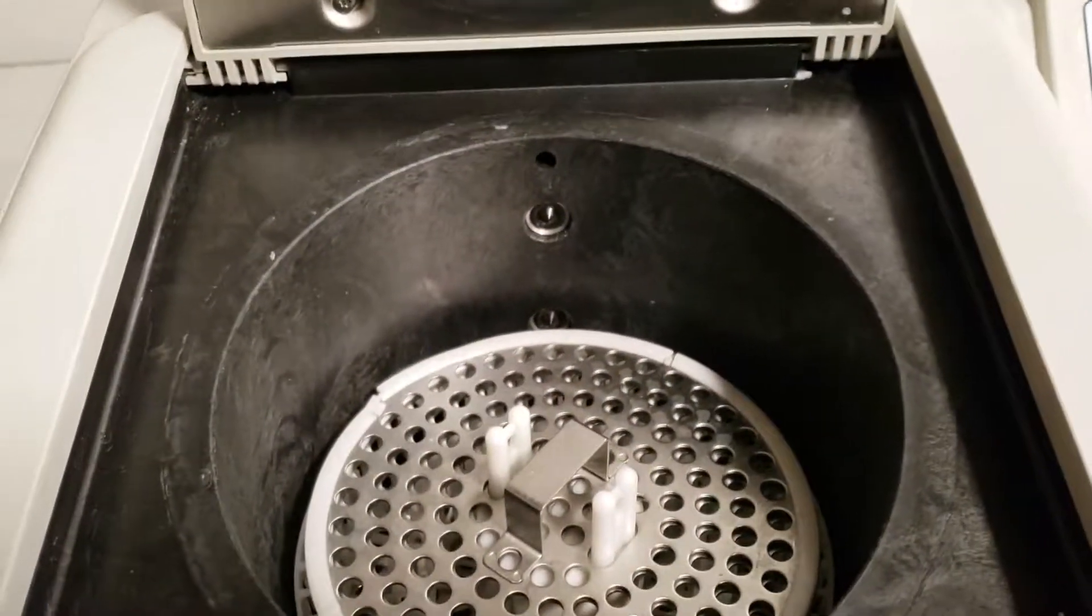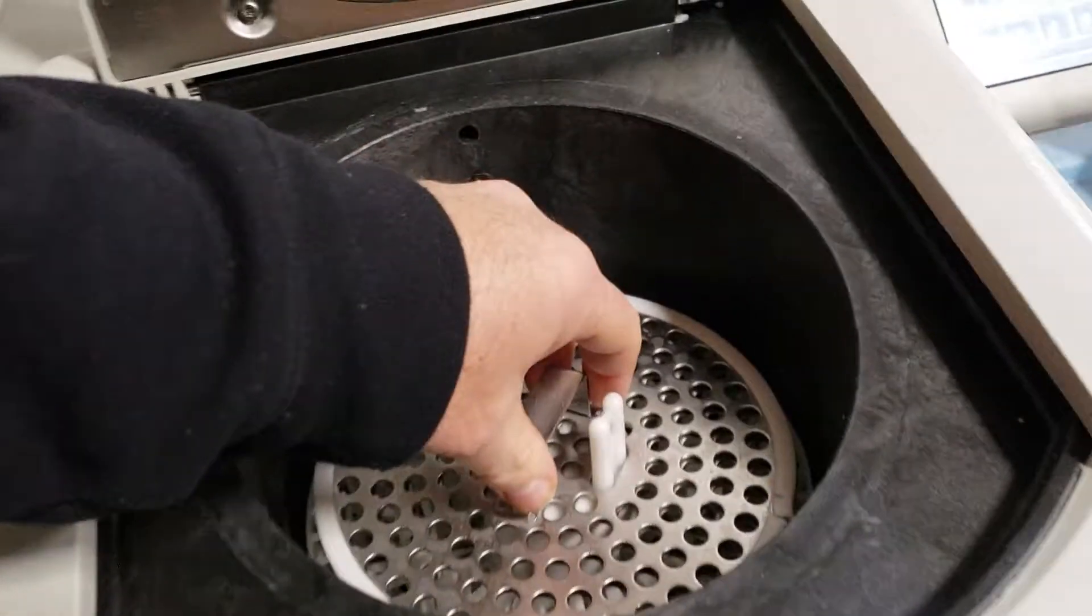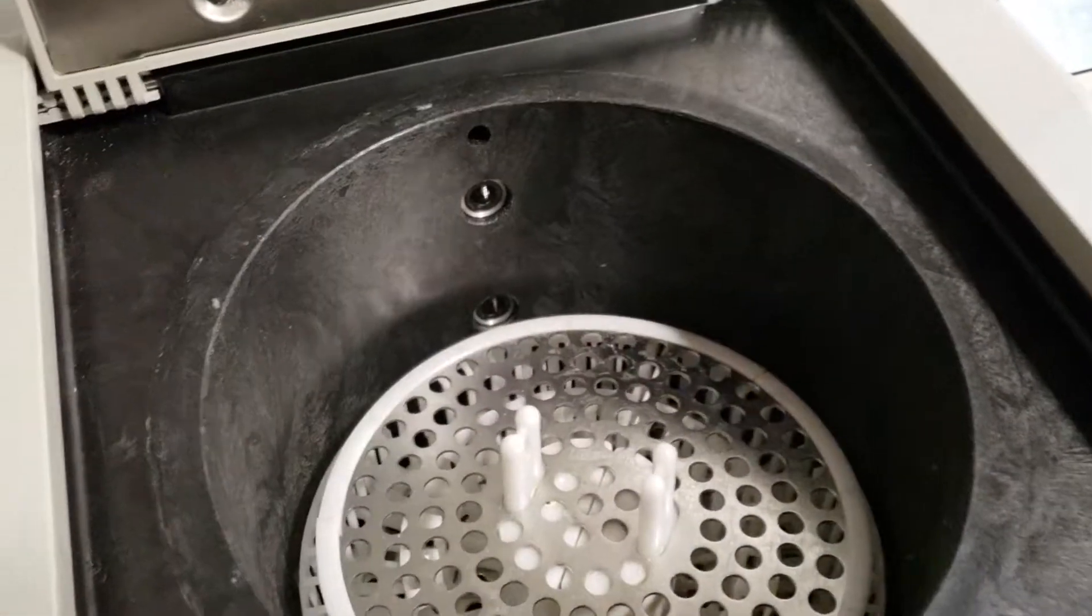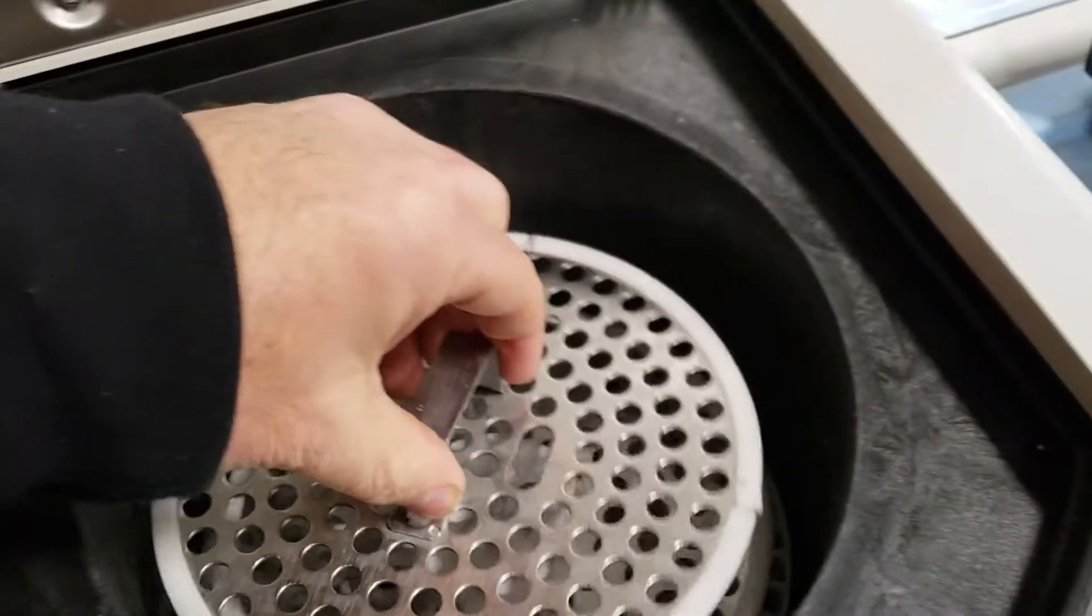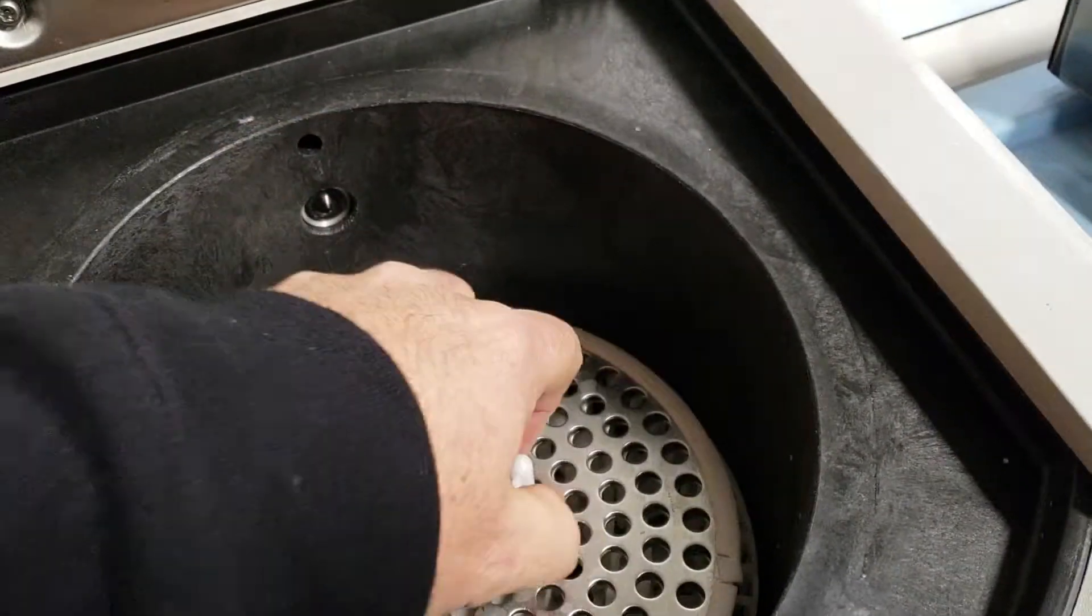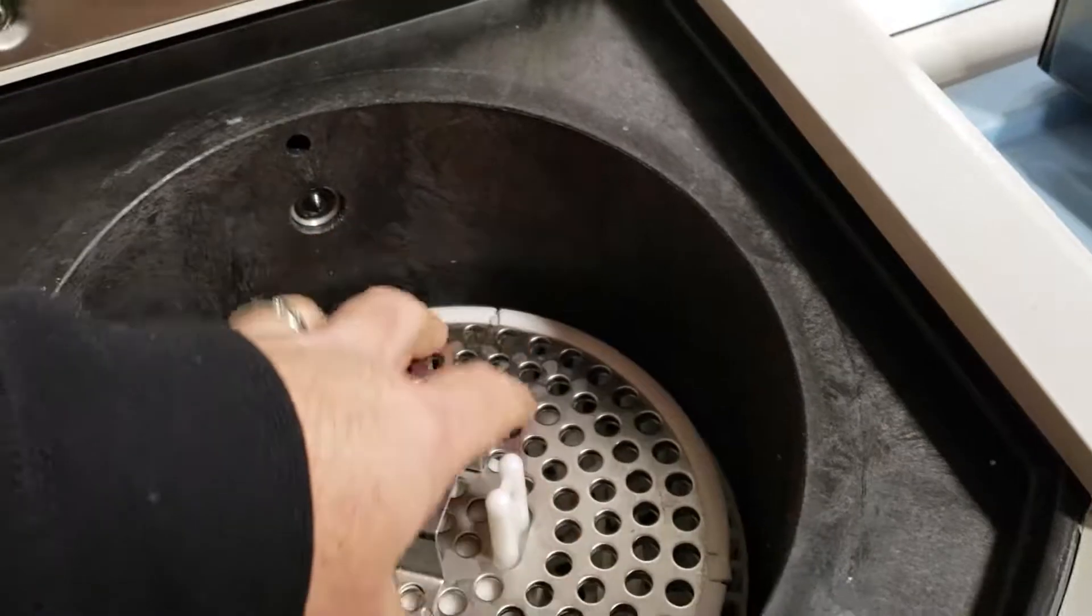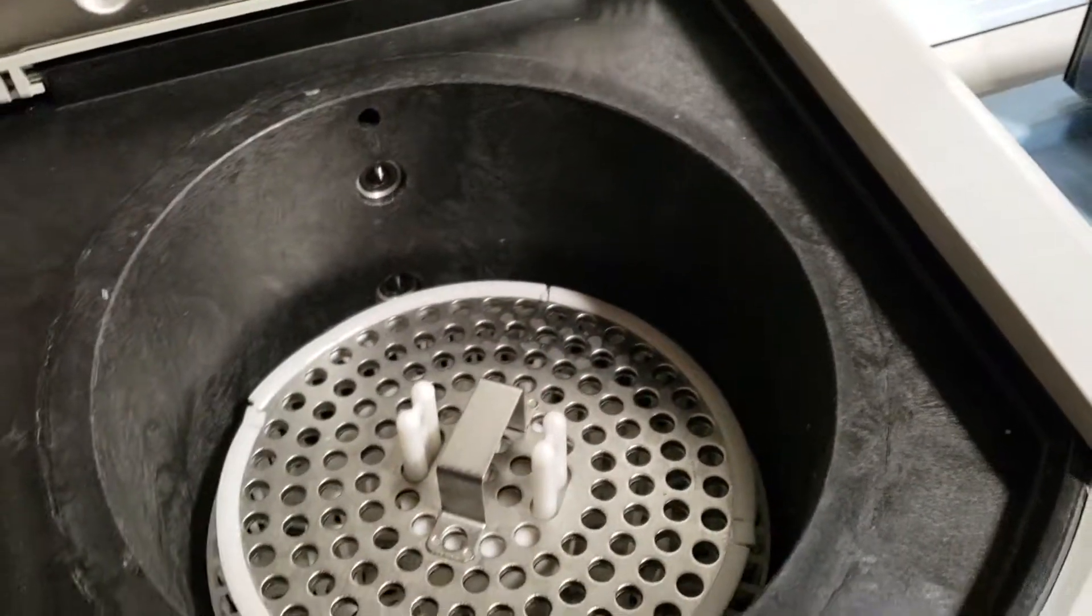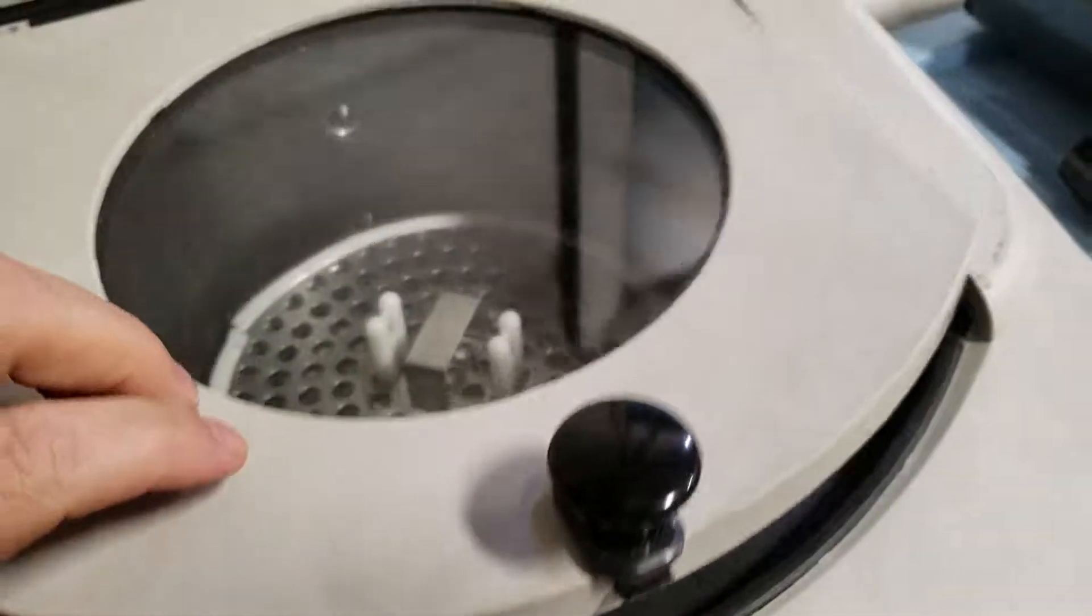You can hear the fan come on. There are three trays in here and it takes three trays with separator plates.